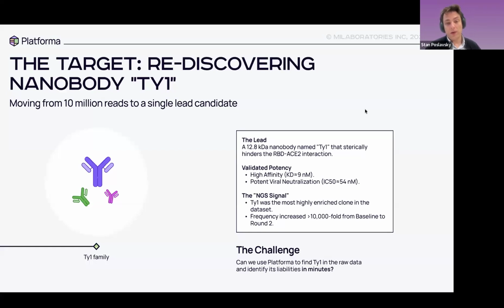The authors of the publication found one lead candidate, TY1. We're going to see whether there is something more interesting. This TY1 was validated. It has high affinity. It is a really good candidate with clear NGS support.